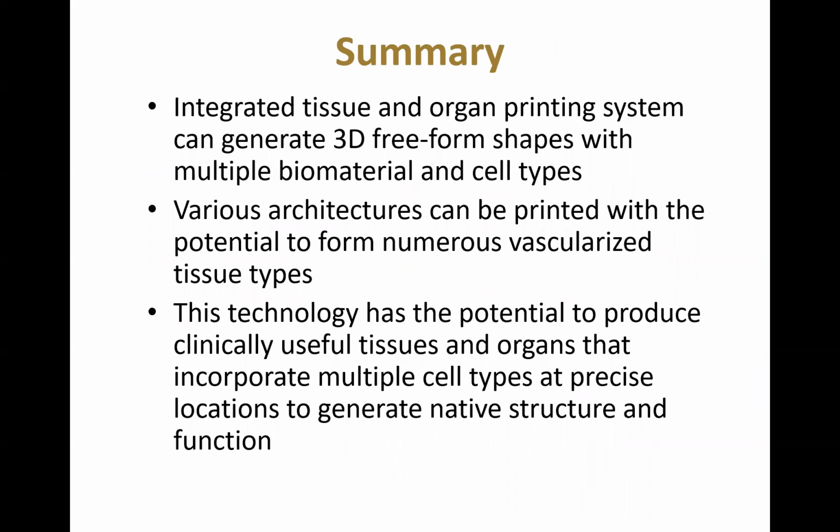So in summary, I've given you just a very brief overview of bioprinting and described our integrated tissue and organ printing system and how we use that in our regenerative medicine and tissue engineering research projects. And it really gives us the opportunity to use this enabling technology to really leap forward in terms of regenerative medicine and tissue engineering.